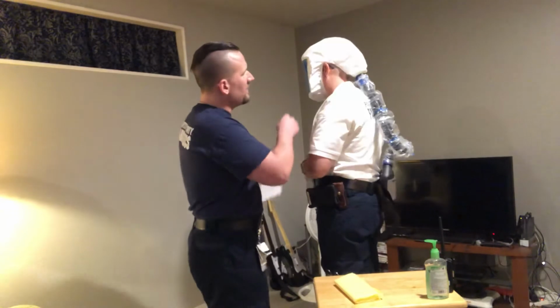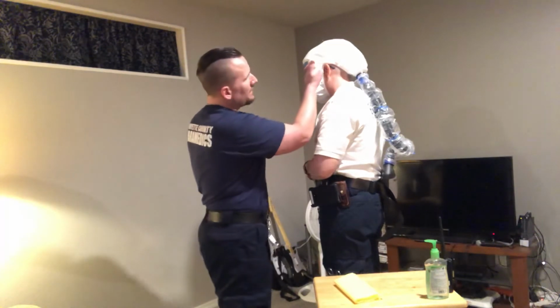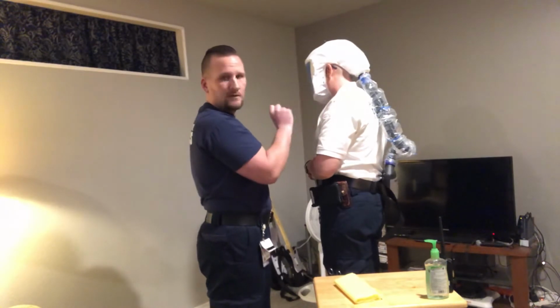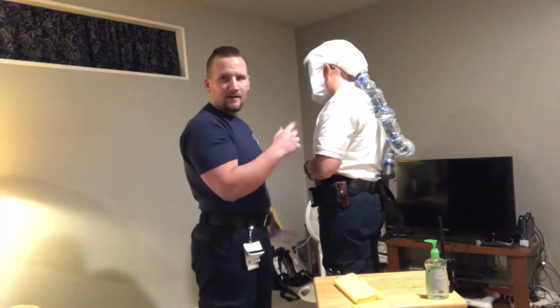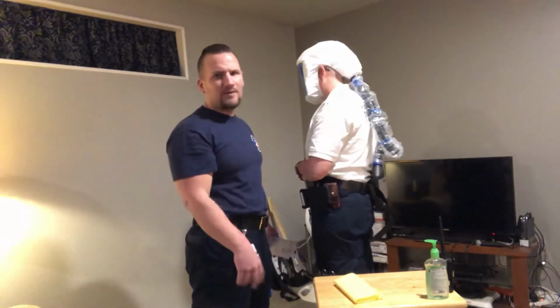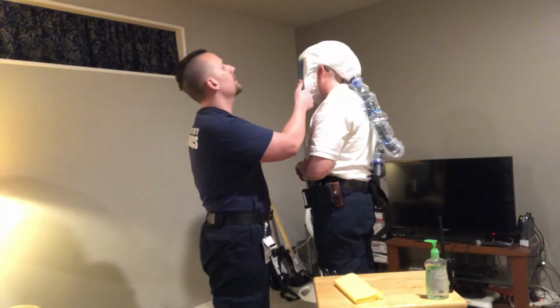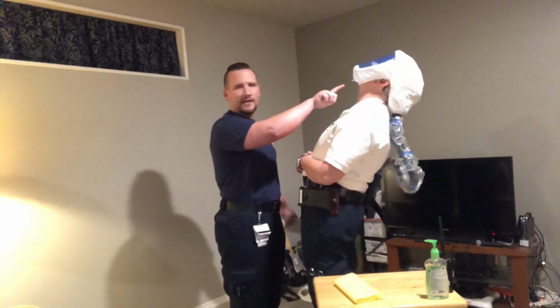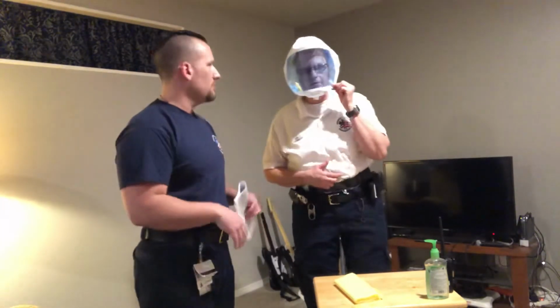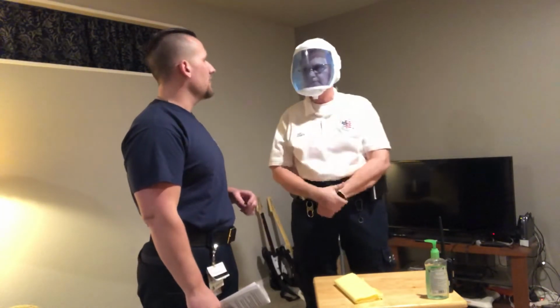That's fine. And then as you can see, the hose stays connected, just hangs down in the back, okay? The outside of the mask is going to come right up. It's not supposed to cover the ear. Don't tuck your ears in, it'll break the seal. Don't do any silliness like that. People have tried to do that for some unknown reason. I've seen people try to tuck their ears up into the PAPR. Just don't. It's designed to go around and outside and come down. It's going to go down underneath your chin, just like an N95, and then wrap up and around the other ear, okay? She wears glasses, that's fine, not a problem. That's one of the nice things about the PAPR too, it's flexible, you can do that and you're okay. Yeah, that's a good point.